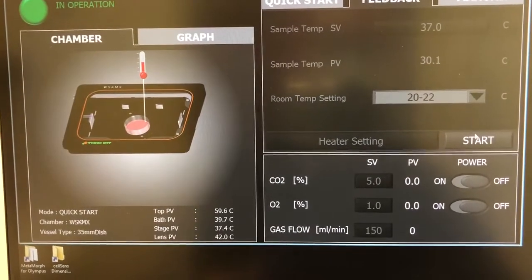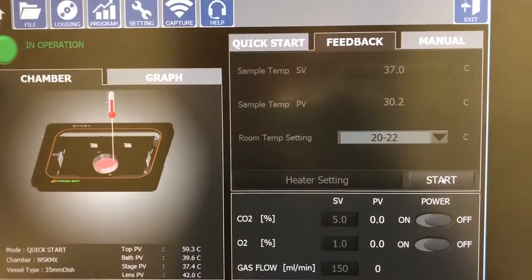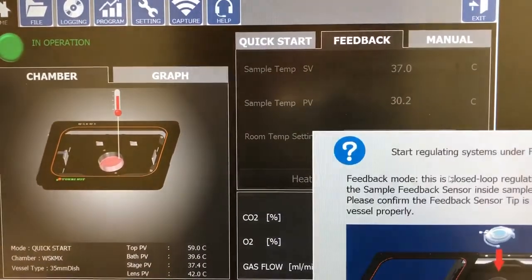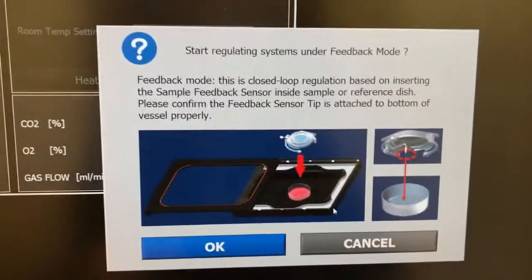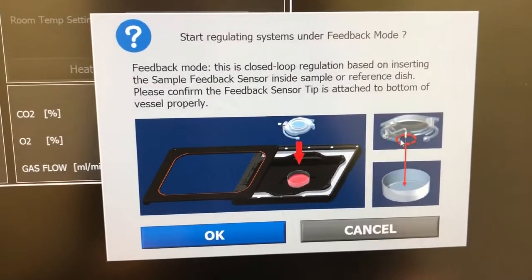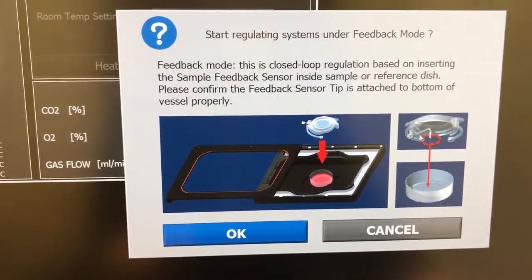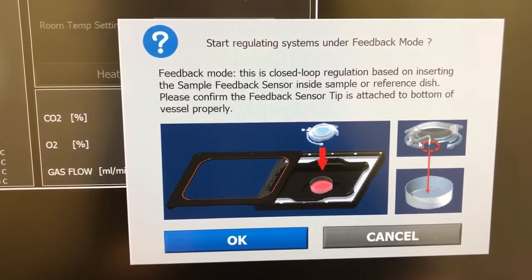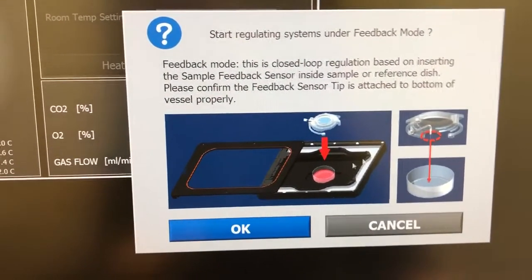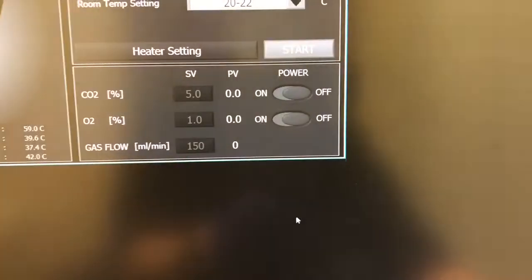We want the feedback to be on. So this is very important. So here it explains that for feedback to work, you need to have the sensor inside the sample. Say OK.